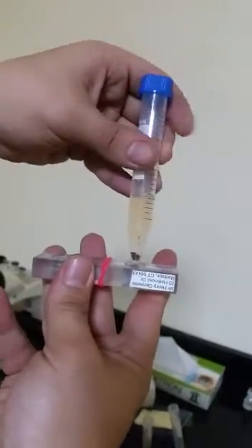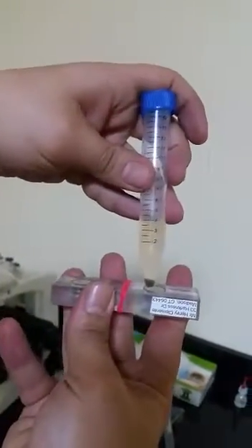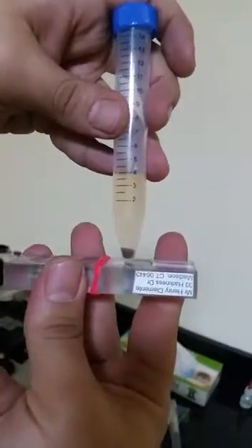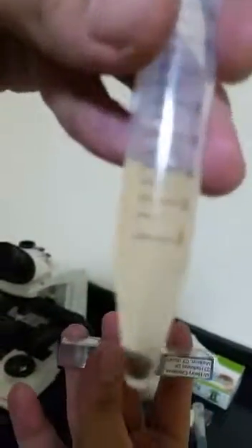That was a simple procedure showing you how our nanoparticles for the fertility line and cell separation line are extremely responsive to magnetic fields, and that our magnet is capable of 100% complete separation.